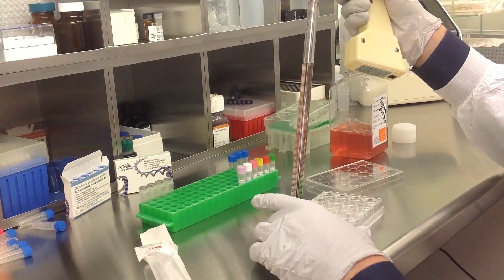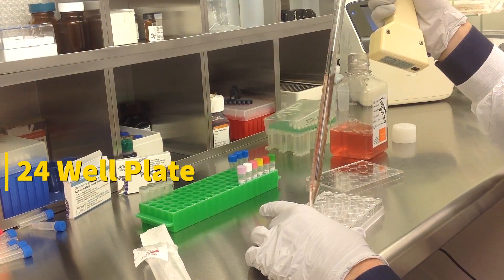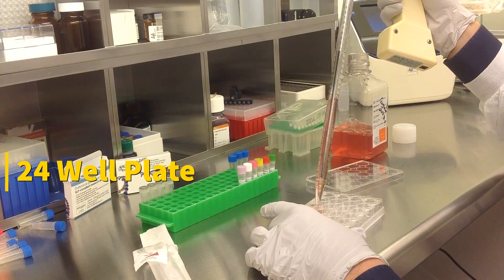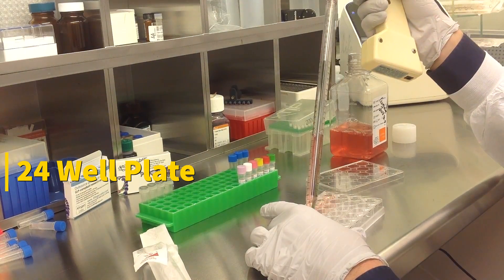Today we will be transfecting 293 T1-7 cells obtained from ATCC, using a transfection kit manufactured by Altagen Biosystems. In this tutorial, we use a 24-well plate. Transfections can be scaled up or down based on plate surface area as described in the corresponding transfection protocol, which can be found at altagen.com.